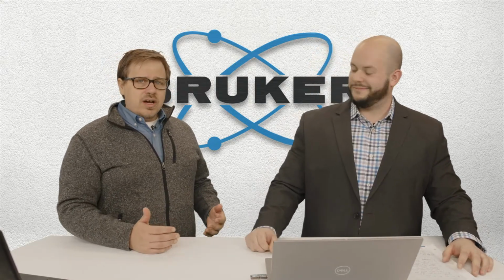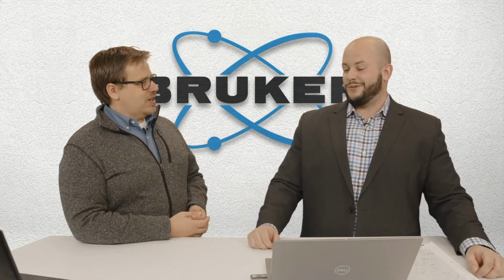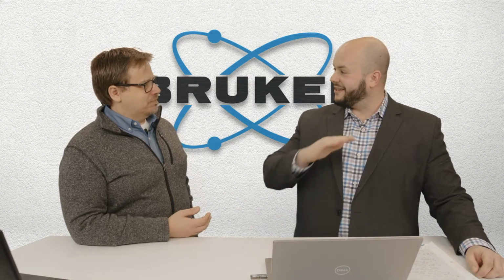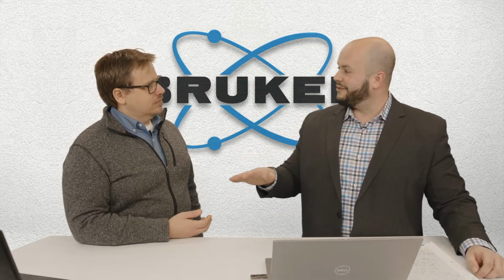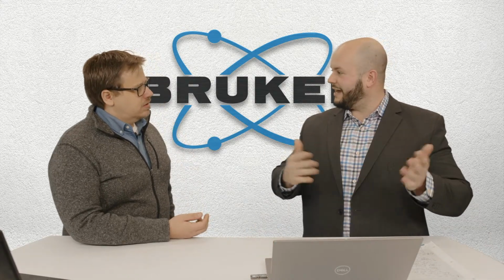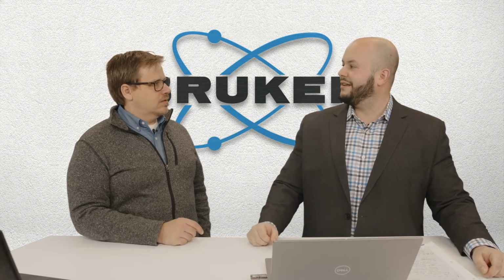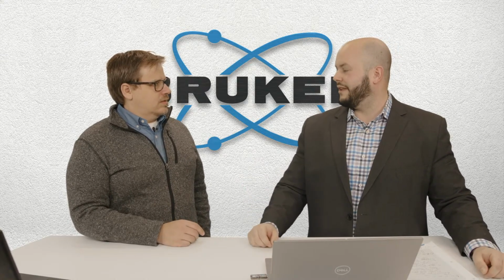Yeah. So now let's contrast a little bit with some other techniques. AFM's one that'll get you roughness on the top surface, but it doesn't tell you anything about the buried layers that are underneath that. If you have some kind of a super lattice or something like that, multiple thin film layers, it's not going to tell you any information about the roughness of those individual layers.